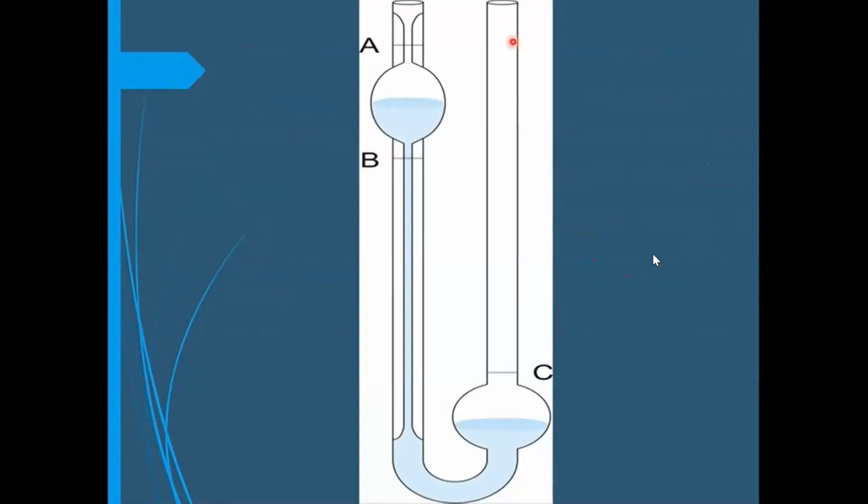And we will put the liquid or the solutions we prepared inside the viscometer and calculate the flow time from point A to point B, and this is the flow time for this solution inside the viscometer, okay? And we will repeat it with solvent and with dilution solutions to calculate many flow times for different solutions.